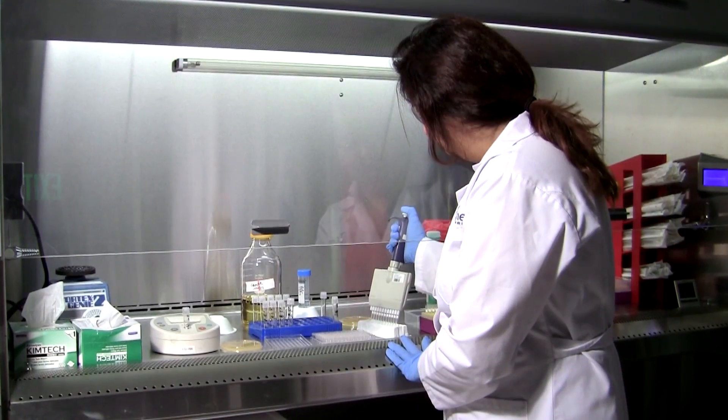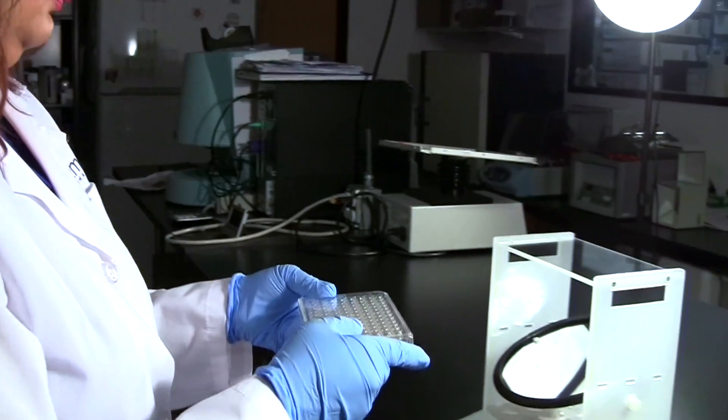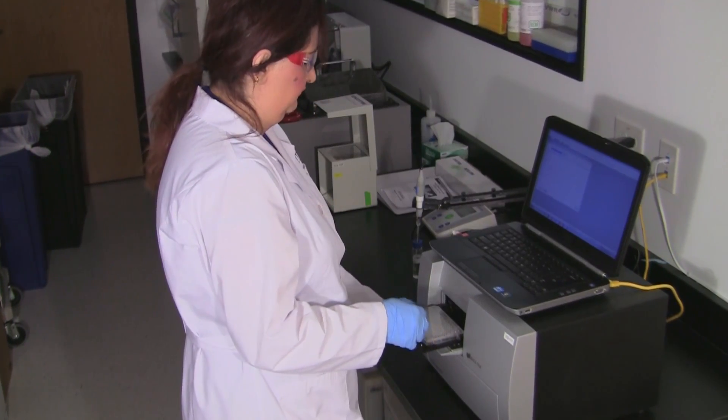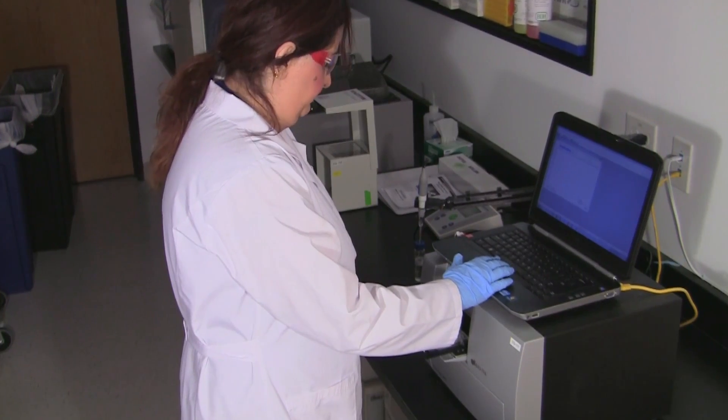At Emory Pharma, we provide an array of microbiological services that can help test your compounds or medical devices against a broad range of multi-drug resistant strains of bacteria or fungi.